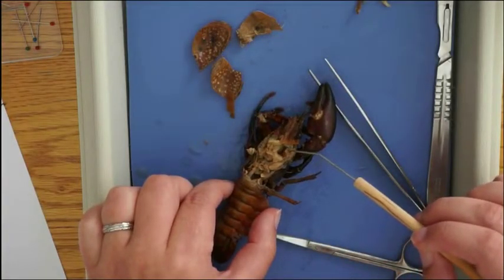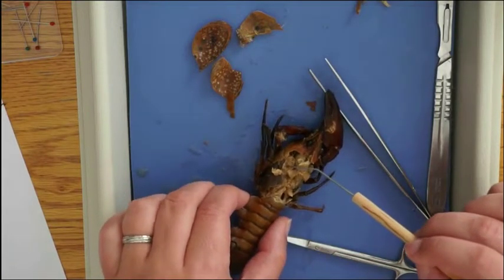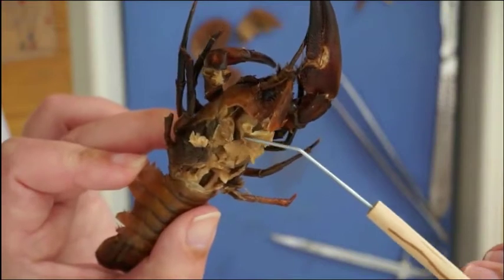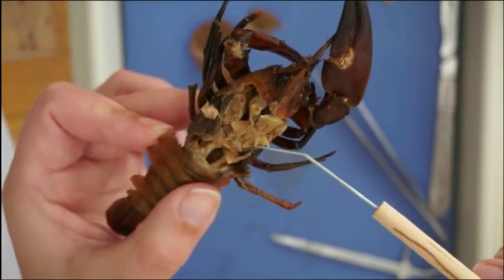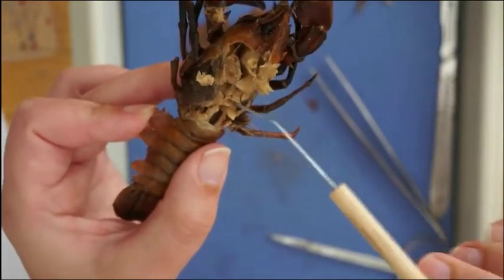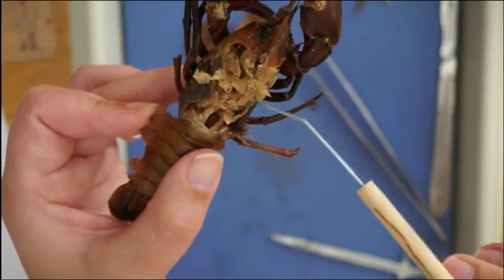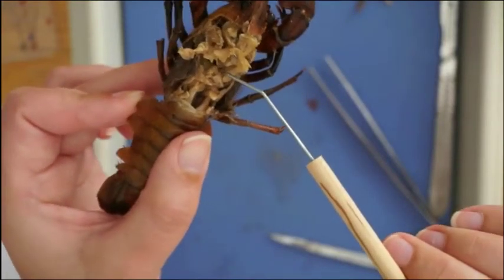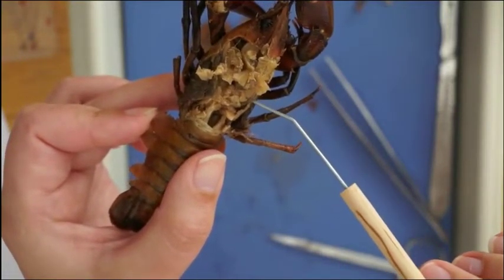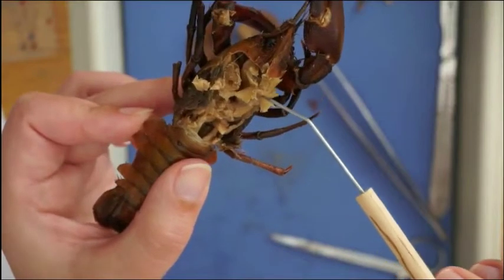On either side of the stomach are the digestive glands — there's one over here and then one on the other side; they're kind of grainy looking. So again, we have the stomach right there, and then the digestive glands. Below that are the gonads — they're a little bit more solid towards the posterior, one on each side. And then underneath the stomach is the sac-like heart, which is slightly darker in color. It's very small and not easy to see on the crayfish, but hopefully you can find it.